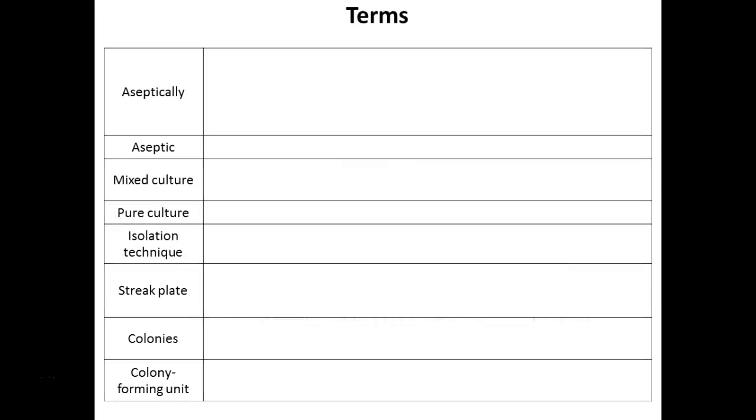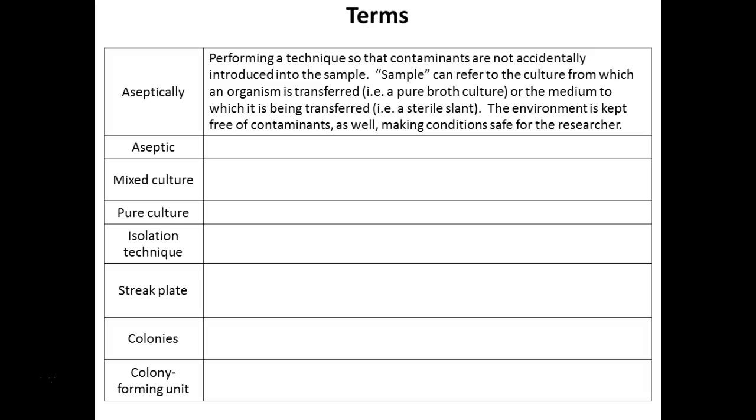So what do we mean when we say aseptically? What are we trying to do? Not necessarily sterile, because is this room sterile? No, right? So I hate the word sterile technique, although sometimes people say that. It isn't truly sterile, right? But we want to try and keep things from getting contaminated, right? That's your kind of key word here.